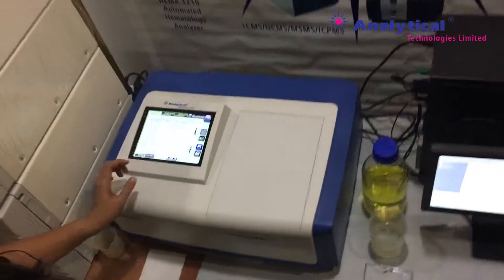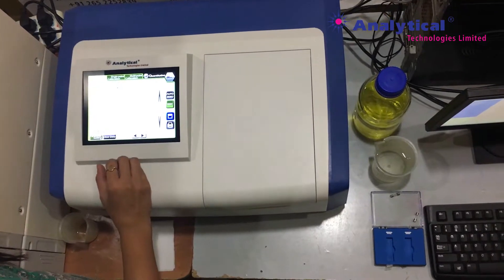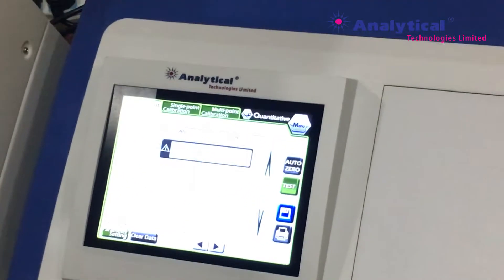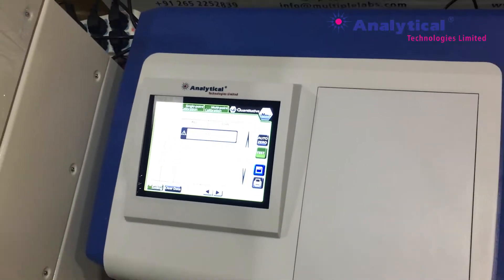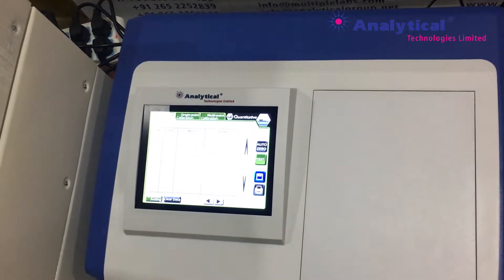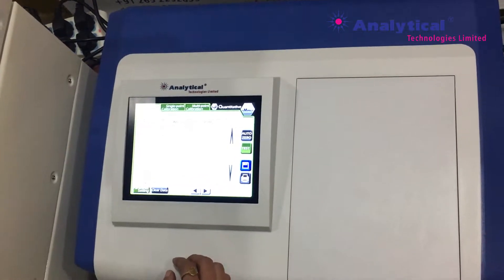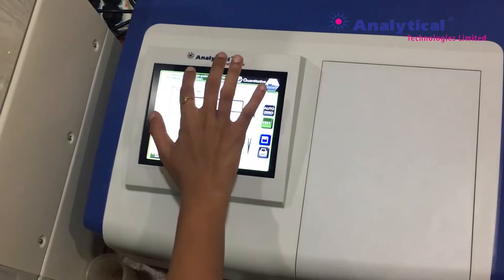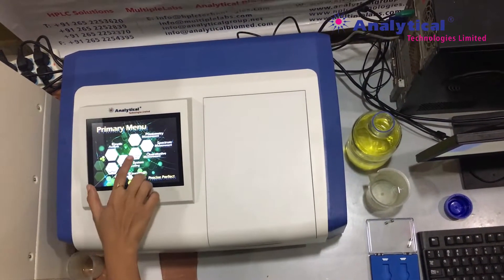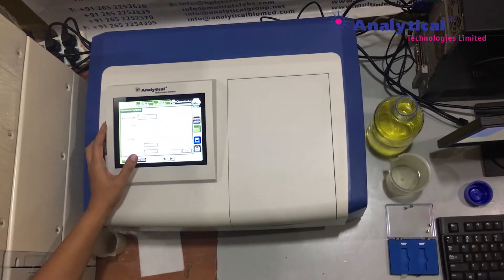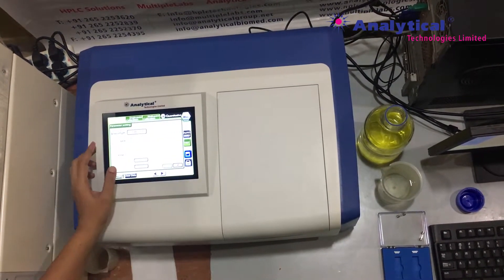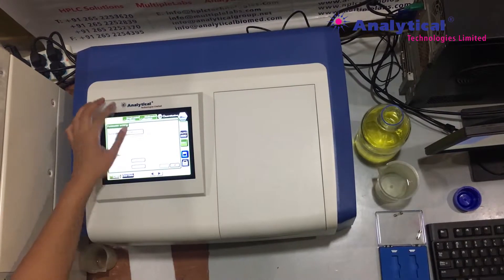For quantitative measurement, you need to move through quantitative measurement where you select a particular wavelength — here I have selected 235nm. For reference, you need to make zero by auto-zero selection. For single point calibration, you need to go with quantitative measurement, then by the parameter setting option, select a particular wavelength — here I am going to choose 235nm and enter. Then select the single point calibration option.